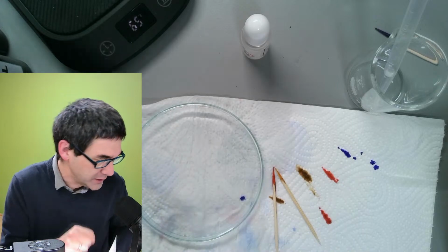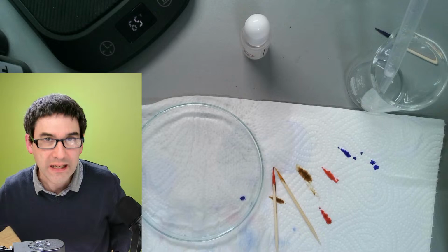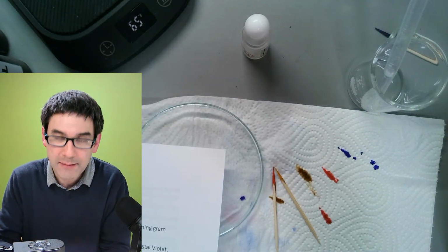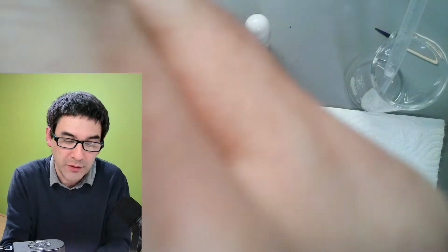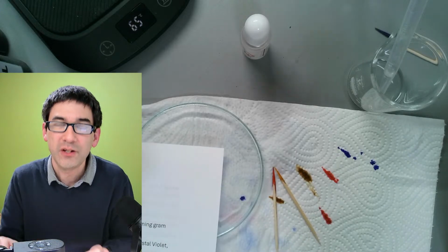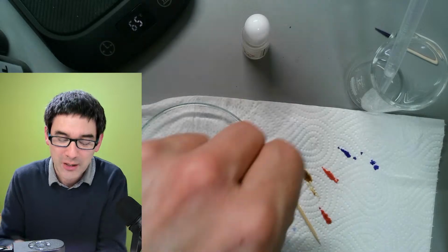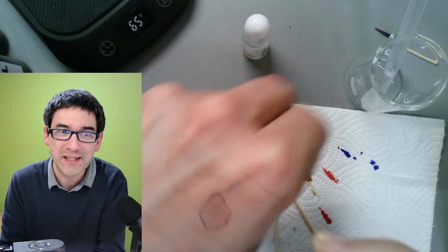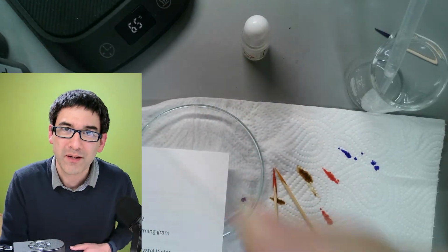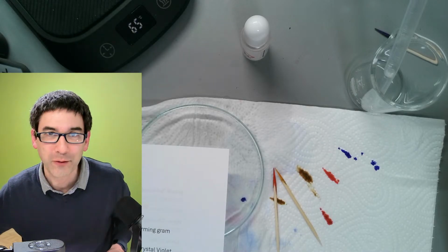What I've done in the lab, when I used the gas burner, I did not even heat test the slide anymore, but I simply pulled it through the flame at a certain speed 2 times, and then I knew that it was hot enough, but not too hot. I had my procedure, a certain speed of pulling it through the gas flame, and then there was no need for actually testing it.